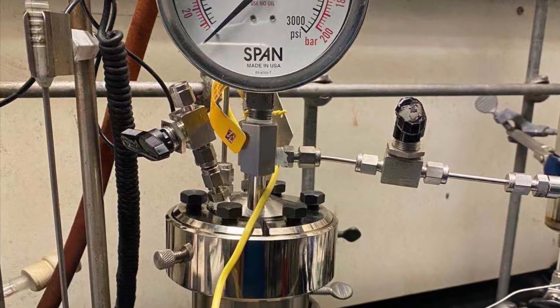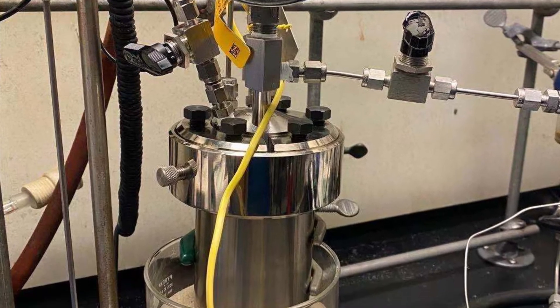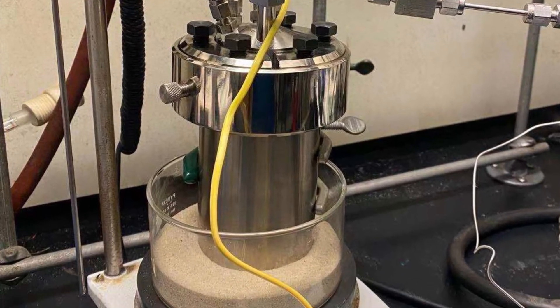And that's how you set up the Paul Reactor. Thanks for listening.